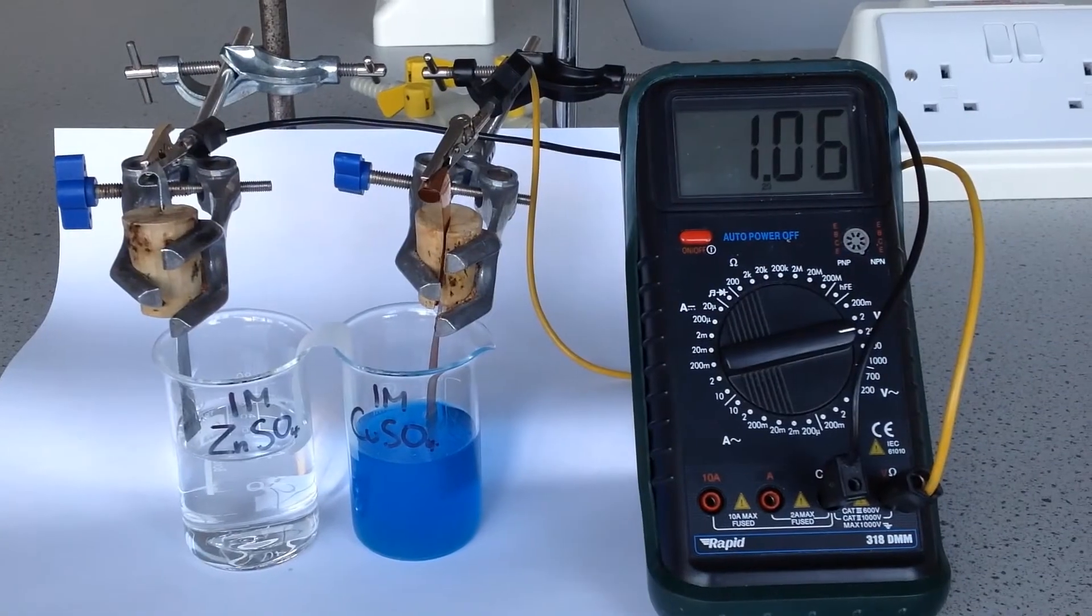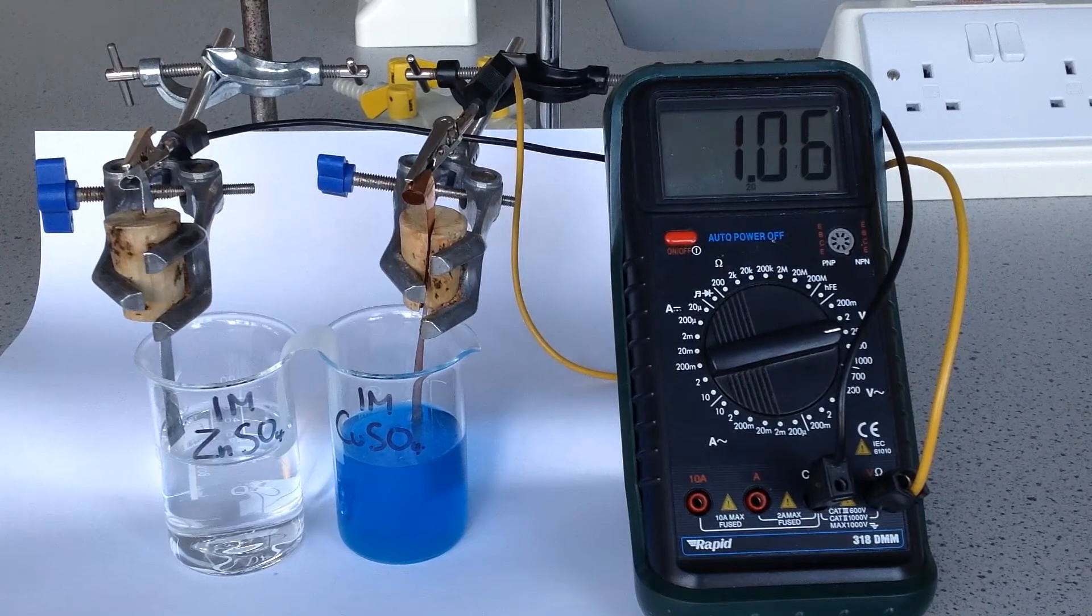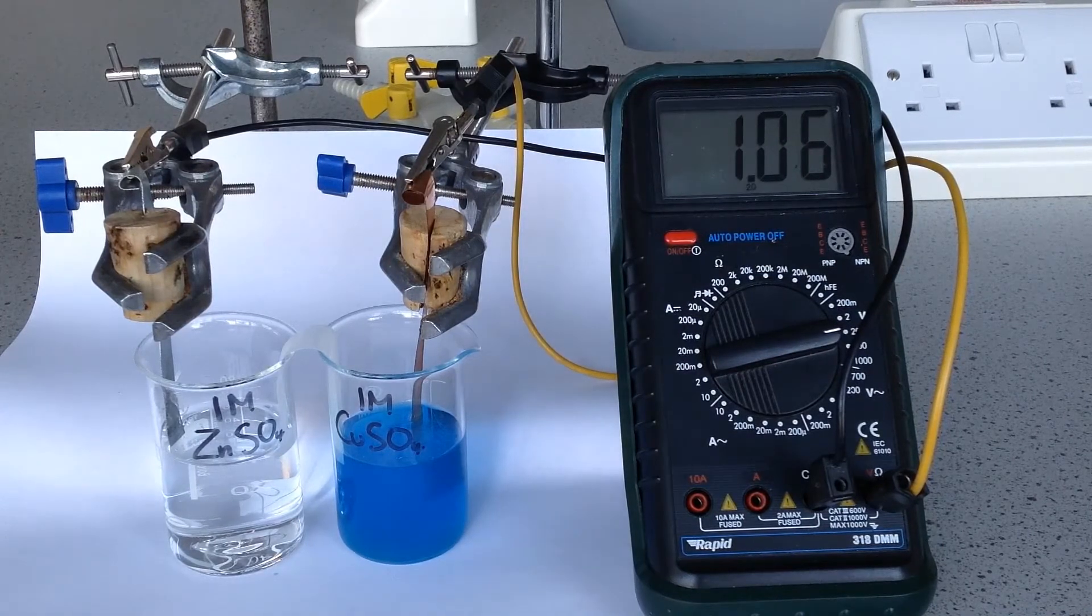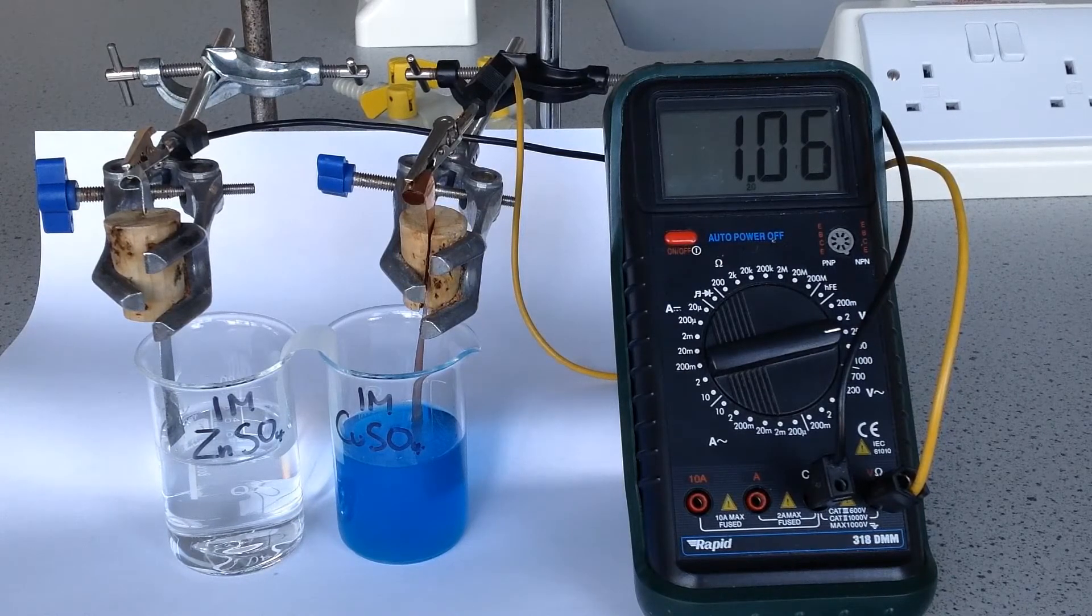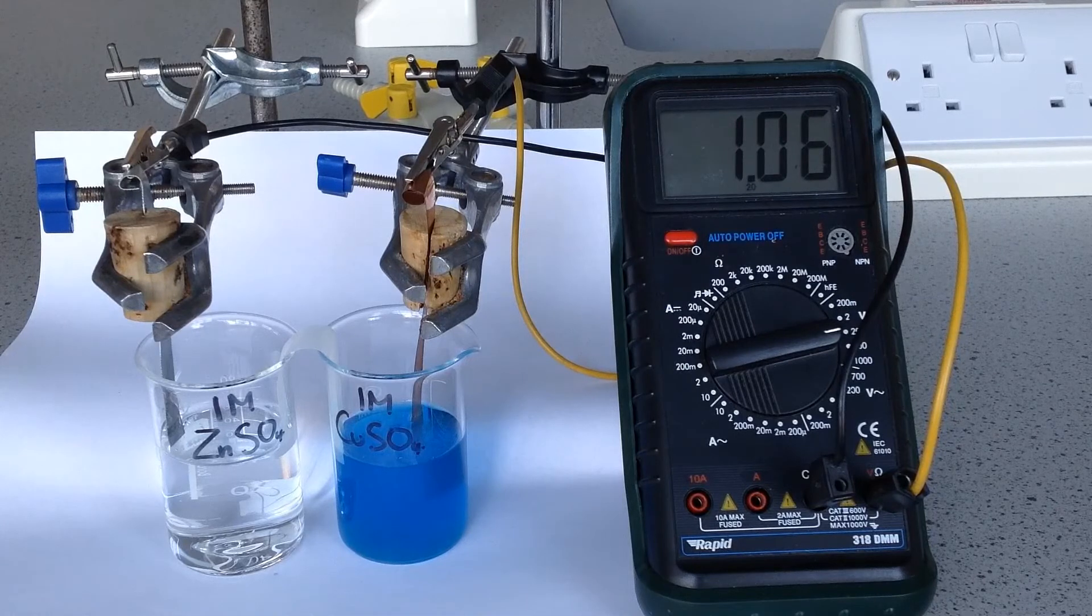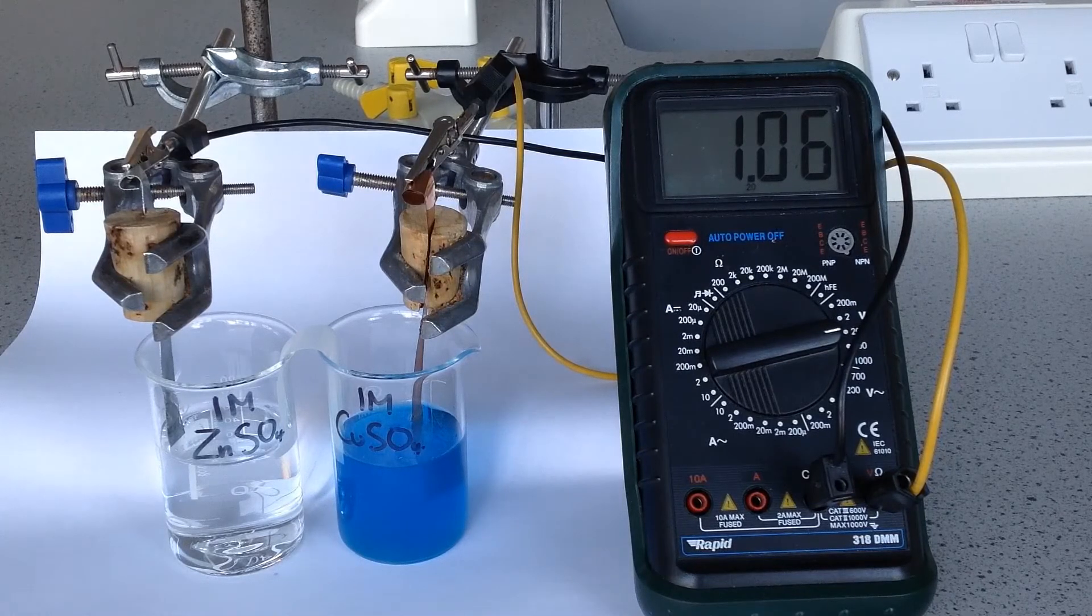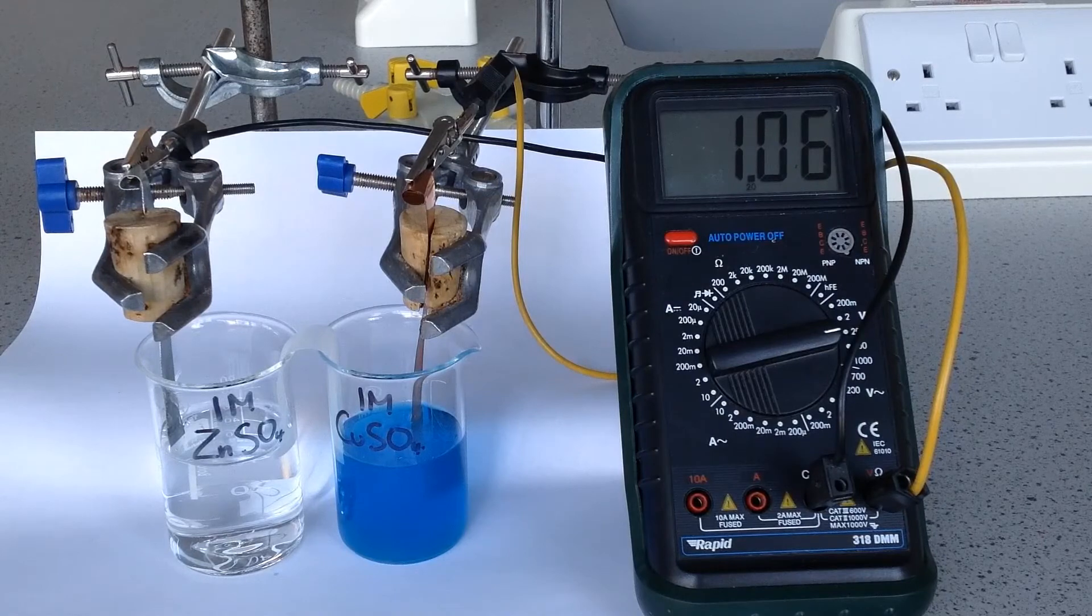Now just a brief note on the terminals here, I happen to have the copper in the positive terminal and the zinc in the negative. The cell potential should always be positive and that indicates to you that the more positive half cell is actually correctly connected to the positive terminal of the voltmetre.